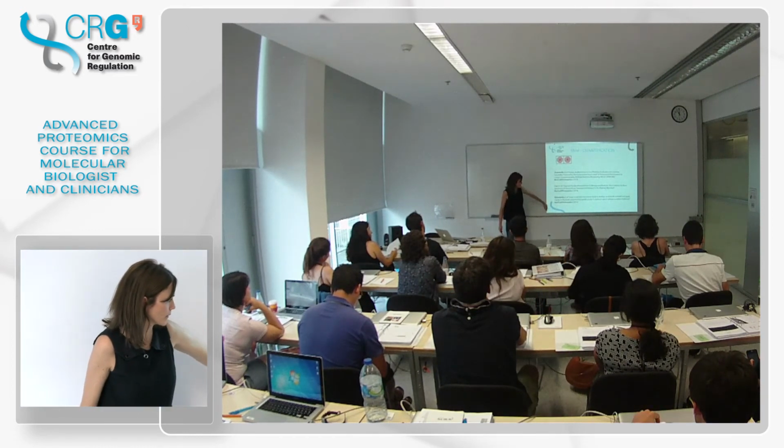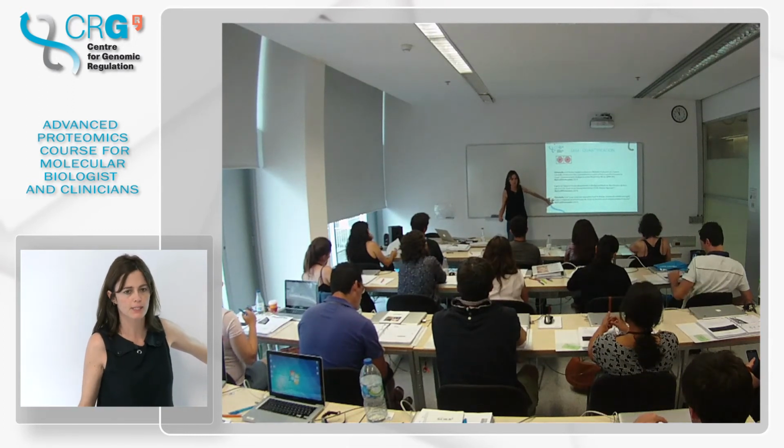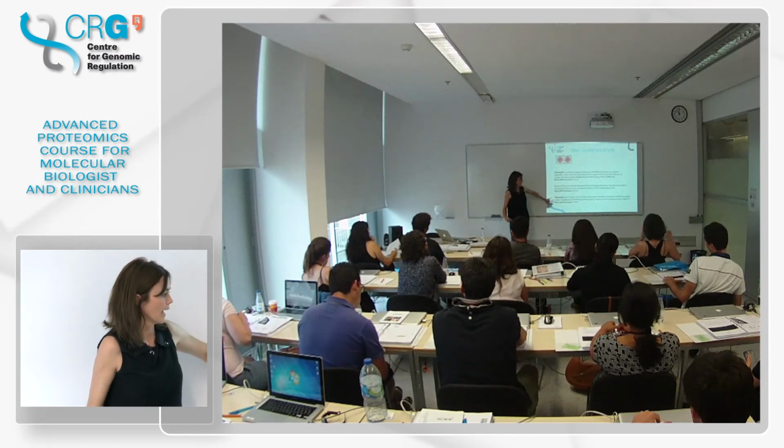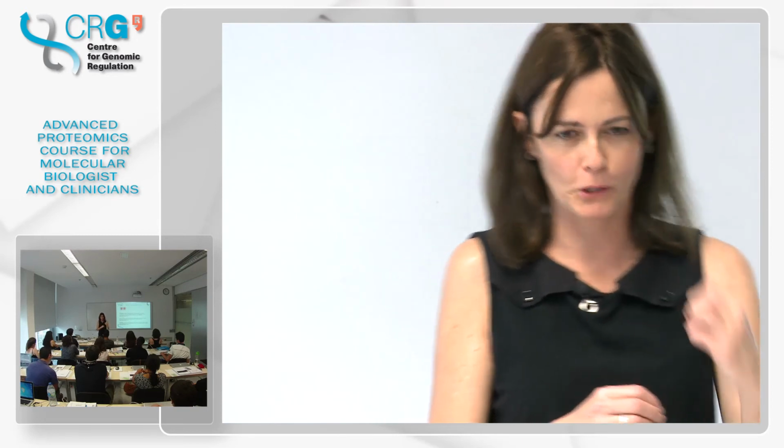Okay. This one is super recent, but it's not the only one. There were previous papers, but these ones are specific, especially careful about all these little things: what is the response of your peptide, stability, digestion efficiency. So these are very thorough studies.